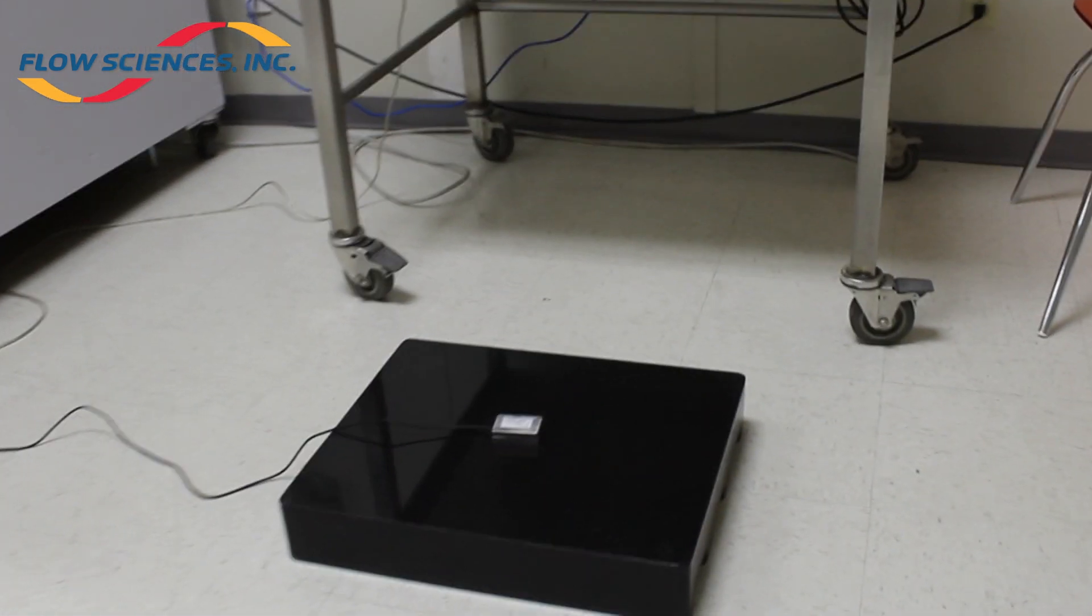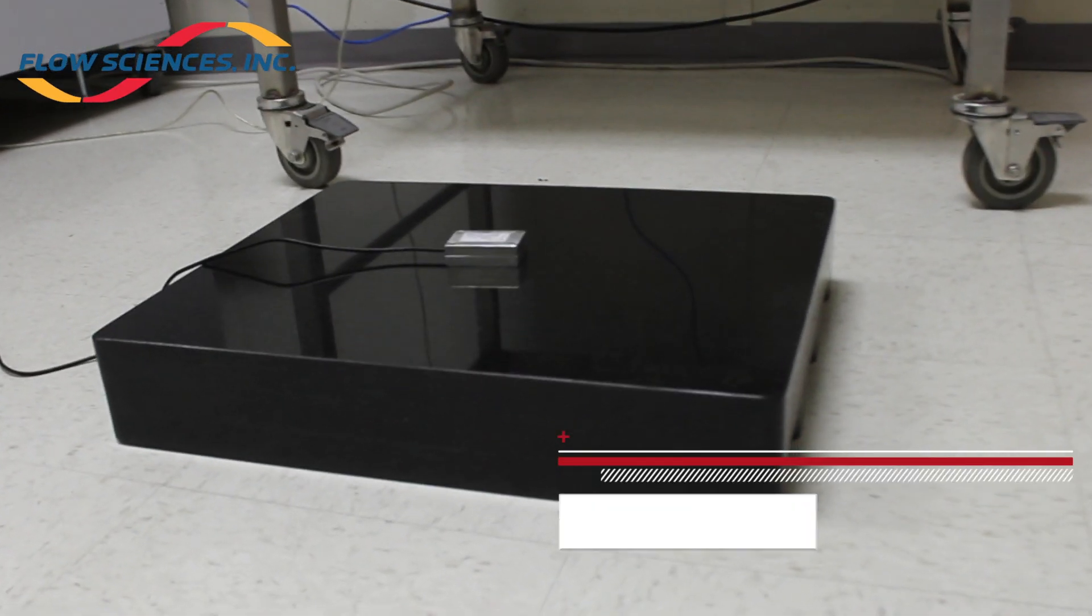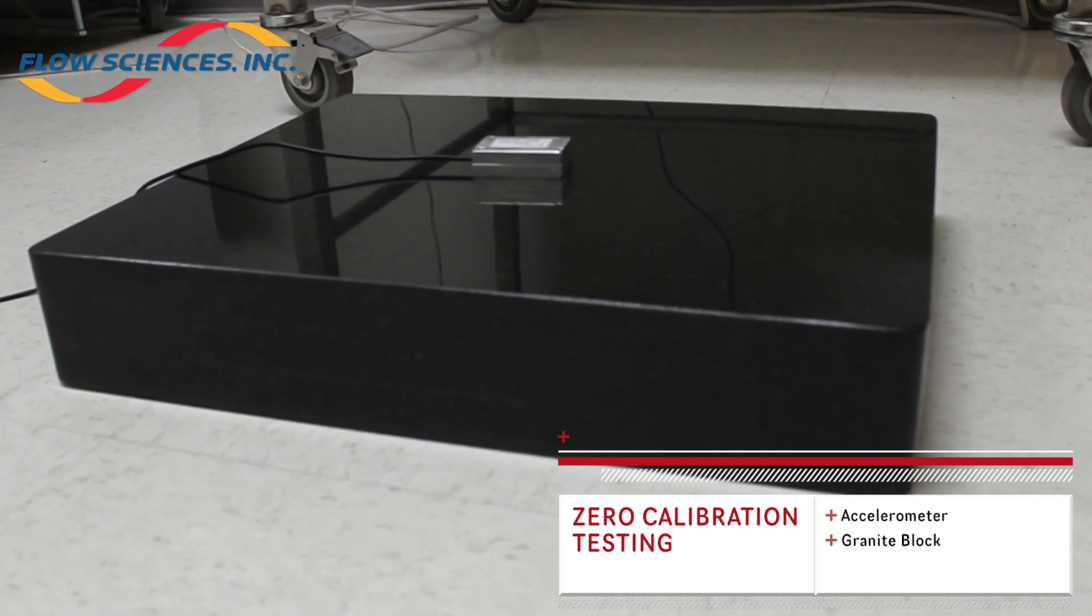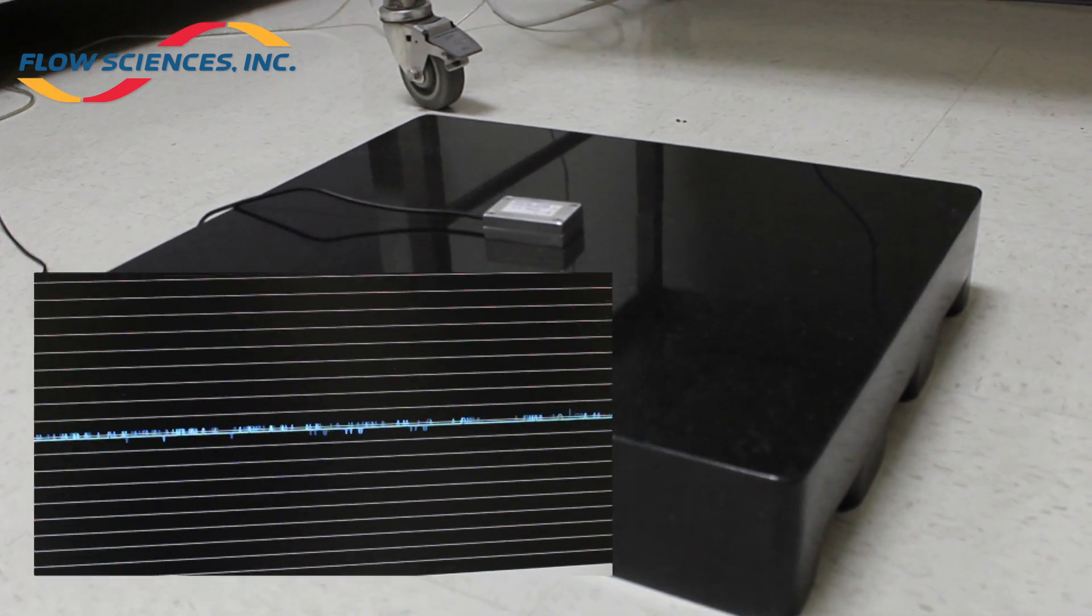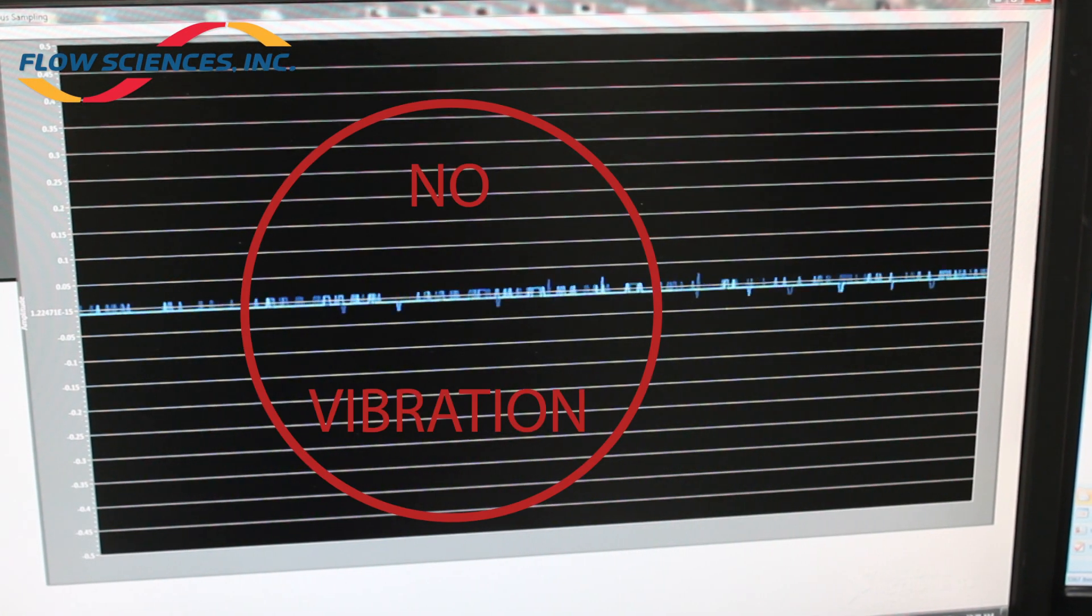Test 1: A granite block was laid on the center of the concrete tile floor in the laboratory. The sensor was placed on top. This was to isolate the sensor as much as possible from any vibrations and get a baseline or zero reading.